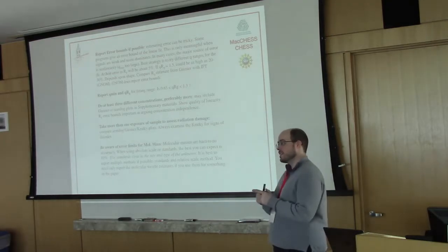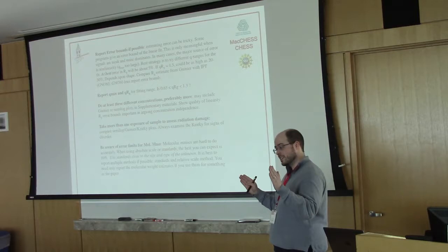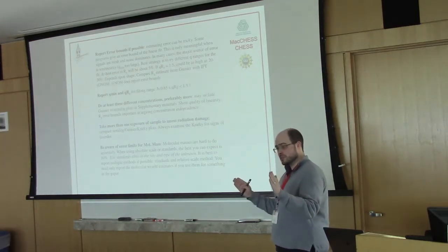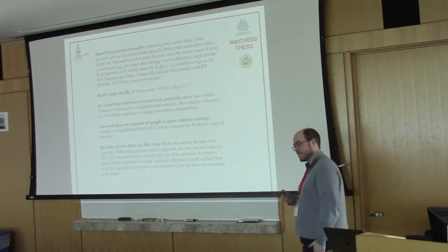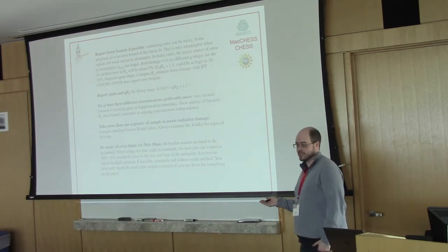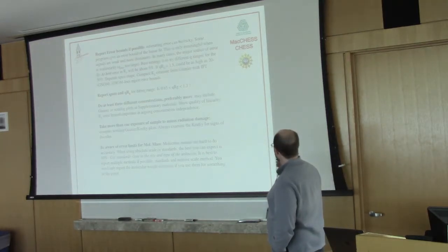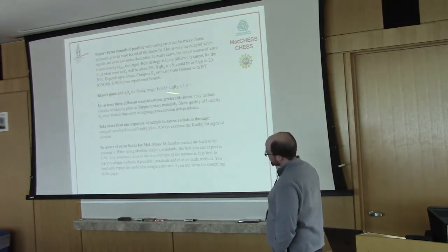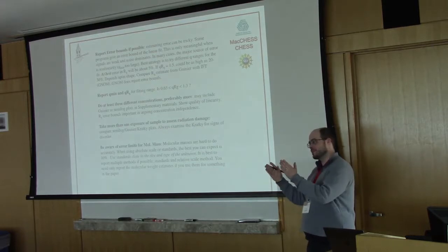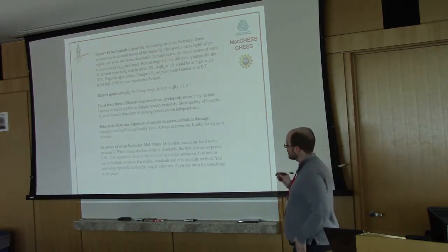The problem with Rg is you have uncertainty in the fit for any given range that you picked, but there's also uncertainty in how you picked the range. So there's two sources that can contribute to this, and it can get a little bit complicated to figure out which one is dominating your system. For Rg, you should always be reporting these ranges that you fit over, because that's very important. If you fit it too far, or you have a very small range of Q that you're fitting, it's likely not giving you good results.